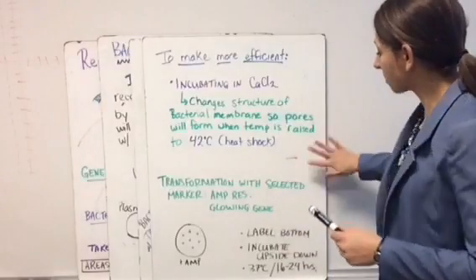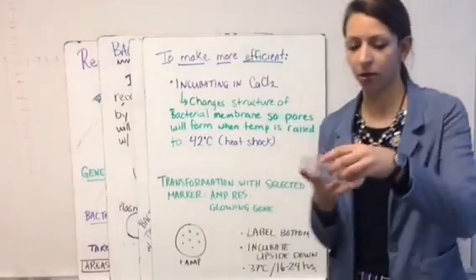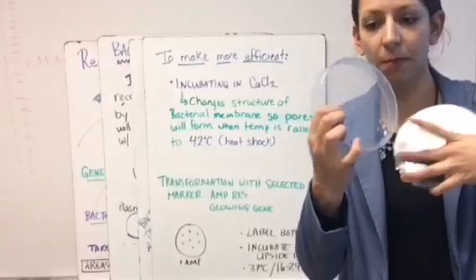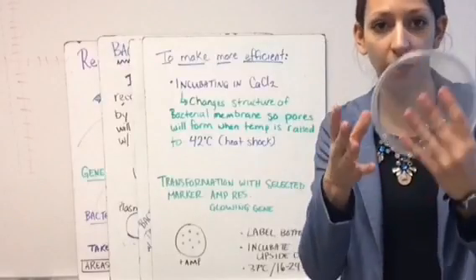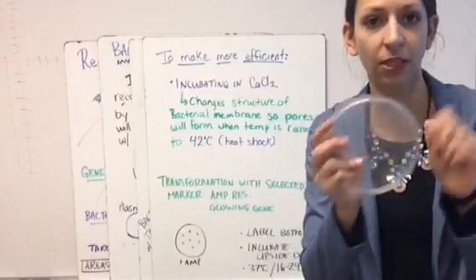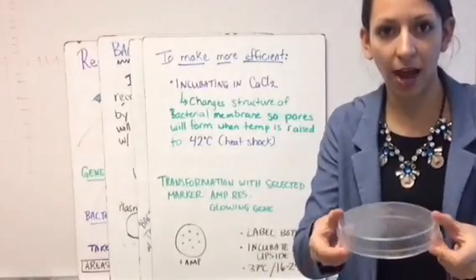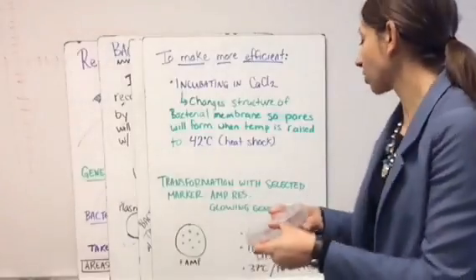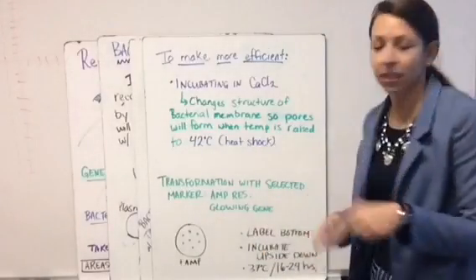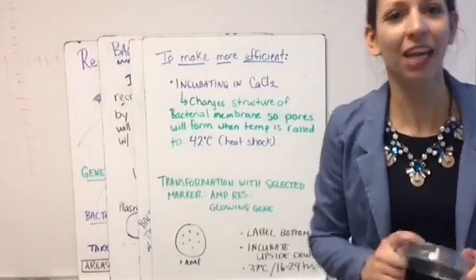All right, some key tips when you're doing this lab, you want to make sure you label the bottom of your plate. So if we have a Petri dish here, we take off the top, our plate that we'll label will be on the bottom. And of course, this is a much larger version than what you'll be using. You'll be wearing gloves and you won't be touching it all over the place. Touch it as little as possible. You're going to incubate it upside down after you've done all the procedures, and you're going to make sure it's nice and warm, so about 37 degrees Celsius, and you're going to do that for 16 to 24 hours. And then hopefully you can see the growth and see if you've had a transformation occur.